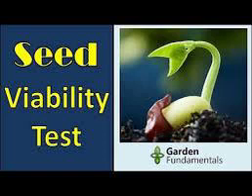Seed vigor index, SVI. This is calculated by determining the germination percentage and seedling length or dry weight of the same seed lot. 100 seeds in 4 replications are germinated as prescribed for the crop specified in the germination test, while evaluating the number of normal seedlings. At the time of final count, the seedling length of 5 randomly selected seedlings is measured and then the average is worked out.